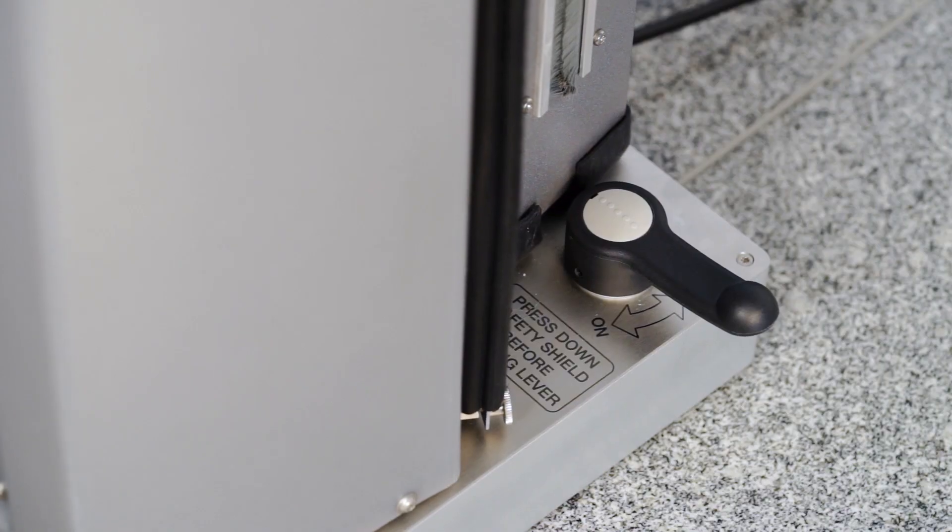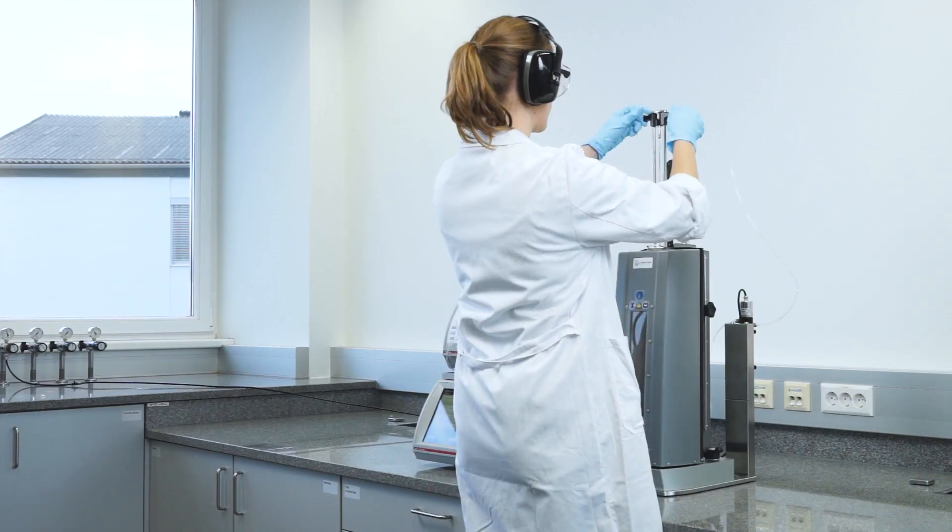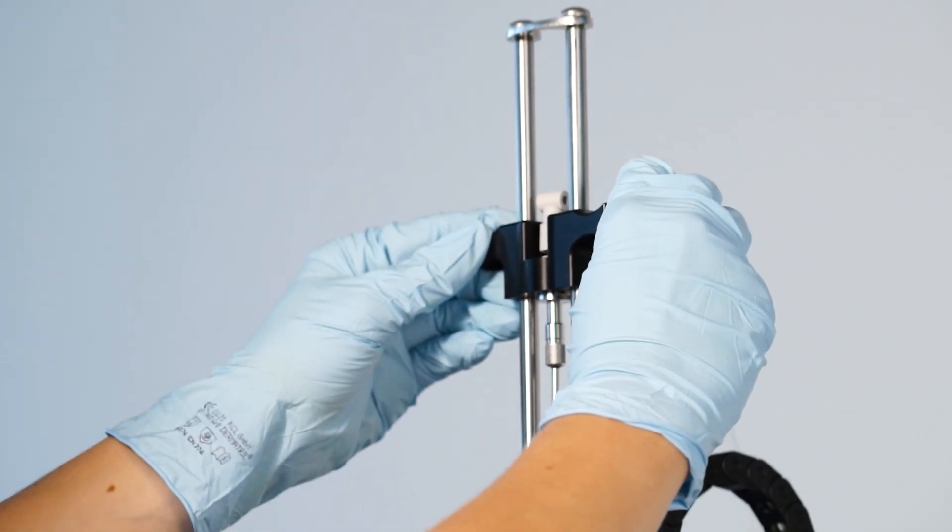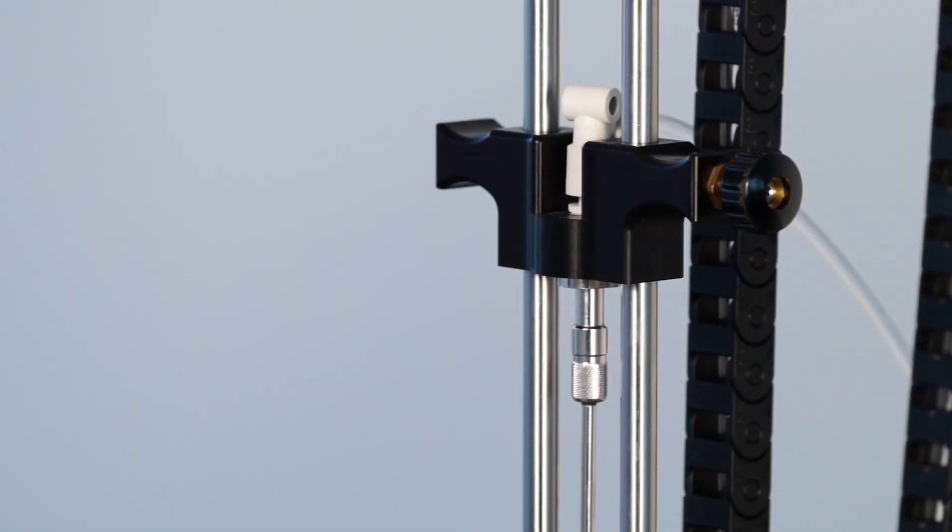Close the safety shield and pull the lever towards you in order to apply pressure. Now the container is pierced and you can lower the filling tube. Please secure its position to be ready for sample transfer.